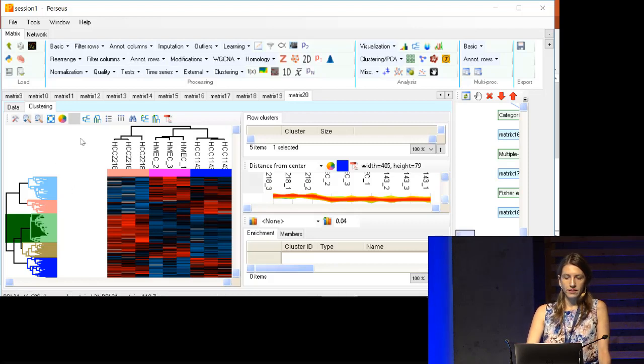So in this case, it's difficult. Like, what is the optimal number? It's more up to you between how you want to distinguish and between which groups you want to distinguish. So in this case, it's entirely up to you.